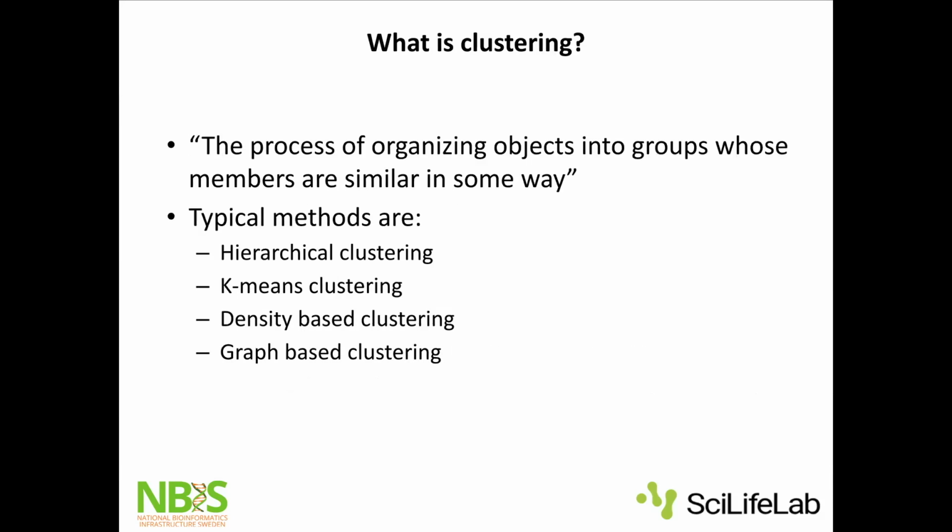But if we get really technical, what is clustering? So the definition I would say is we try to organize objects so that everything that's more similar is grouped together and stuff that is dissimilar is separated. And some classical methods, hierarchical clustering, k-means clustering, I will go through briefly just to explain what they are, and then talk a bit more about graph-based clustering. That's the main method that's being used nowadays in single cell data.